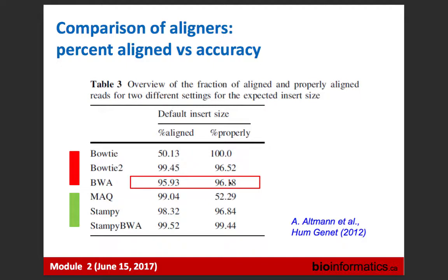Of course, that's not what happens in ChIP-seq because our reads have a tendency to cluster in certain locations. For whole genome shotgun, this will be the right estimate because it's relatively uniform. Or from DNA input, it will be the right estimate because it's relatively uniform. So then you can judge.